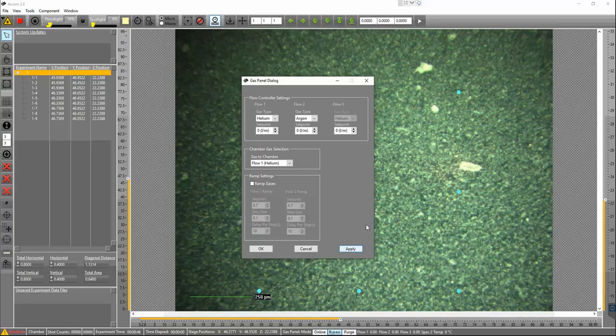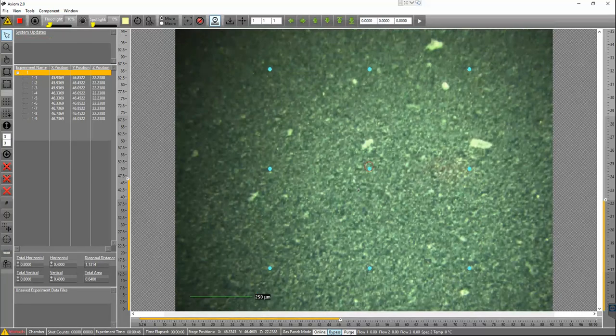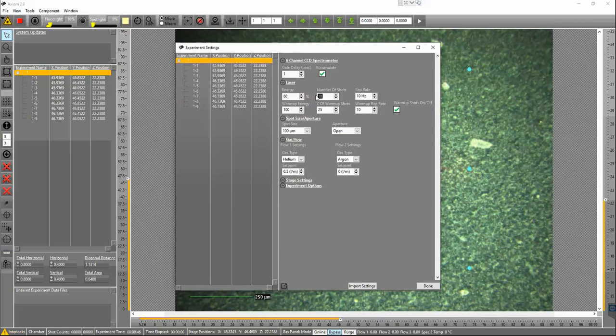Now back to the pattern creation. So I created this pattern, okay, and what I'm going to do is not fire 10 shots, I'm going to fire 25 shots at 60% energy, and I'm going to collect them in a non-accumulated fashion.